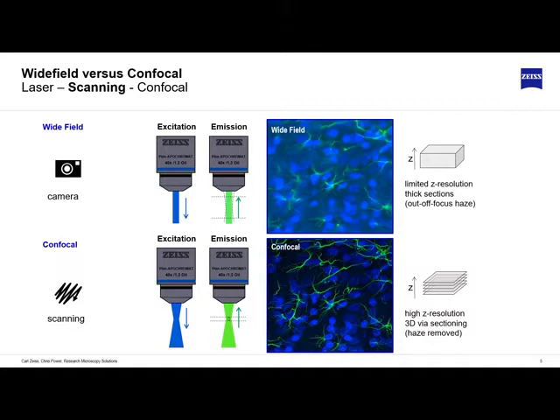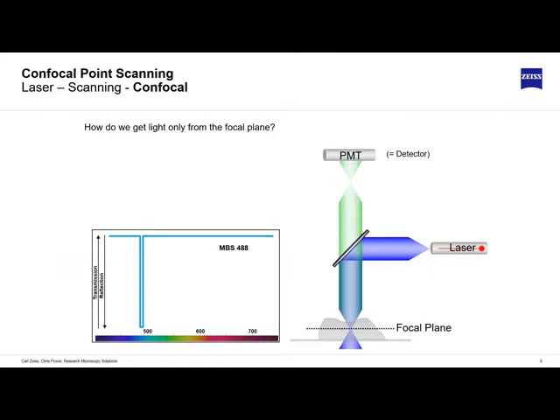But interestingly, it means that from an optics perspective, you can have a single spot on the return. And that's where the third word comes in, which is confocal. So we have this challenge about how do you only get the light from the focal plane? Because everything out of focus isn't helping the analysis of the sample.